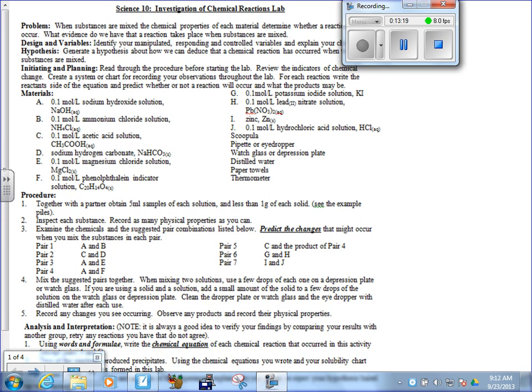All of the solutions are up front. They are labeled with a Jiffy marker on the sides of the beaker, and they are labeled with their chemical formula, not with A, B, C, or D. So you'll have to look at the sides of the beaker to see what it is you're grabbing. For the zinc, there's no scoop in there because it's harmless. That stuff you can touch with your bare hands. Just pick it up and take it with you. It's just little chunks of metal, won't hurt you.